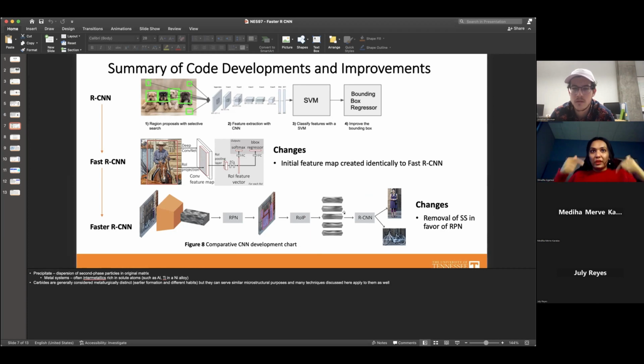Exactly. Now, coming to faster RCNN, what is happening is the bigger blob that you have as a pyramid. Here, in the last image on the screen, you have this orange color, like a big blob. Do you know what it is? Yeah, faster RCNN works quite similar to fast RCNN, where the image is passed through all your convolutional layers and transformed into a feature map.